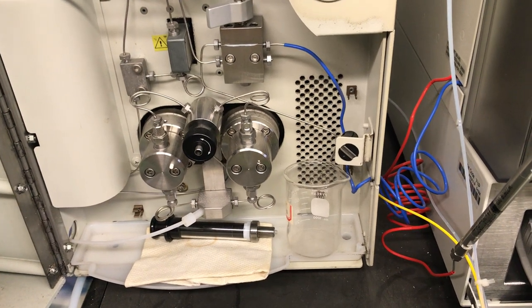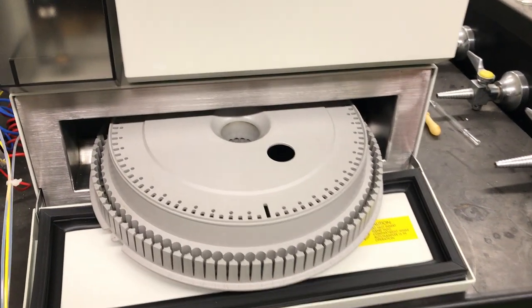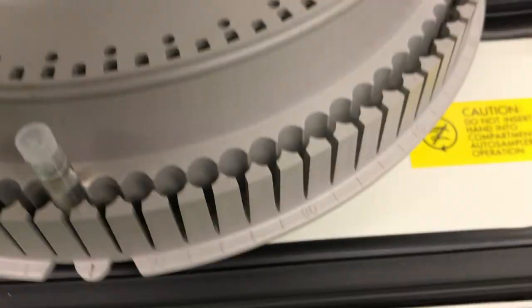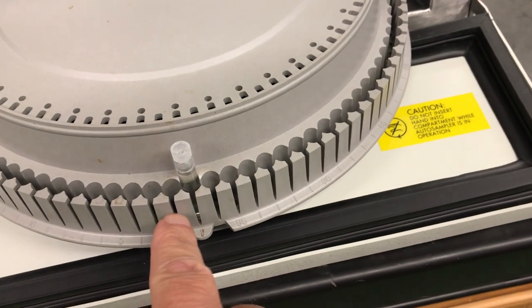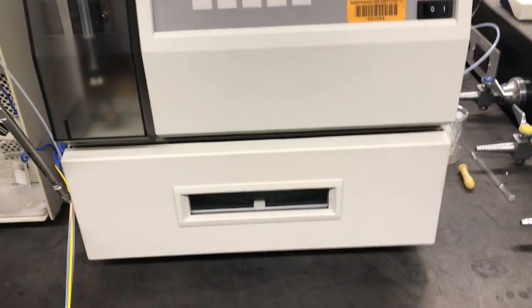From the pumping system we move the mobile phase over to the injector region. We have the Waters 717 Plus Auto Sampler, which serves as the injector. It uses a carousel system. I can load my sample — in this case a caffeine standard — into the carousel. I'm going to turn the carousel to place the vial in carousel position number one. If you had a beverage sample to test, that would go into position number two right next to the standard. We can now close the door on the Auto Sampler, and the carousel will turn and align itself to the proper position.